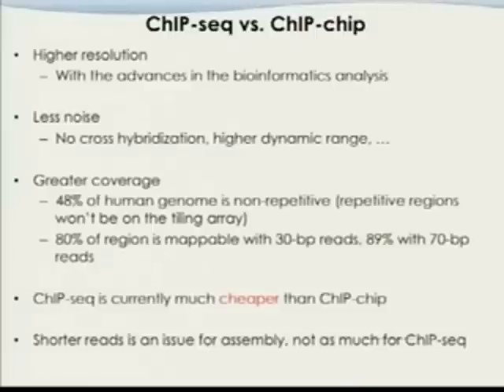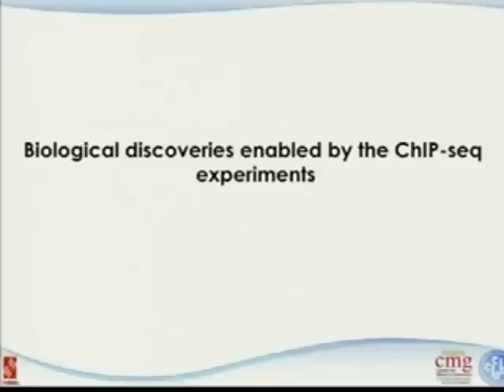And when we talk about short reads, there's one issue that we talked about very early, which is that they are too short. Is that OK? We know that shorter reads are an issue for assembly, but it's not too much of an issue for ChIPseq, so that part can be taken care of. OK? So much for the principles of a ChIPseq experiment.